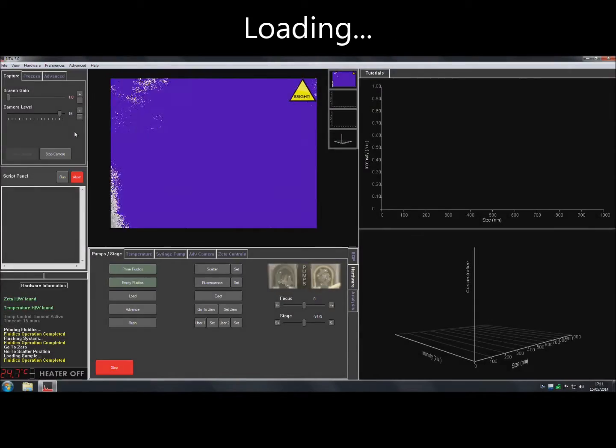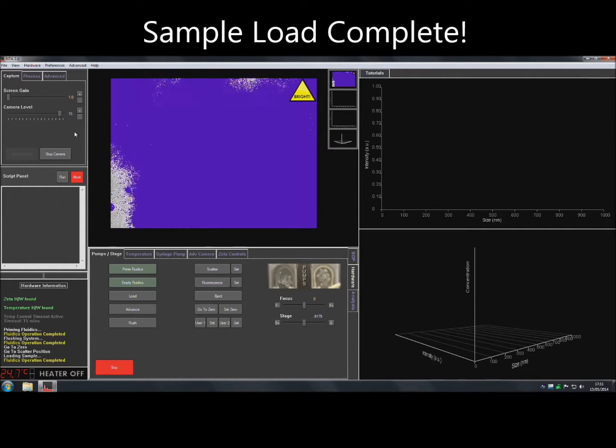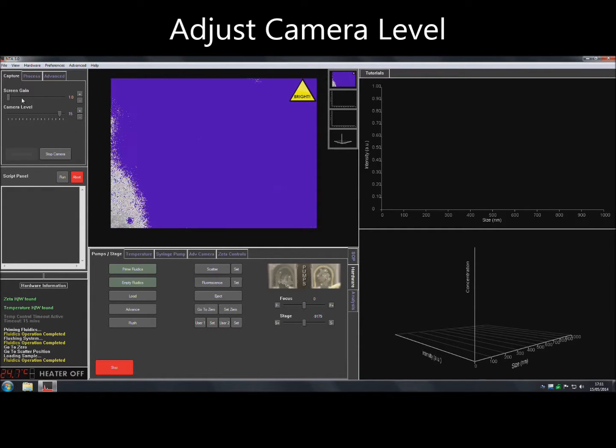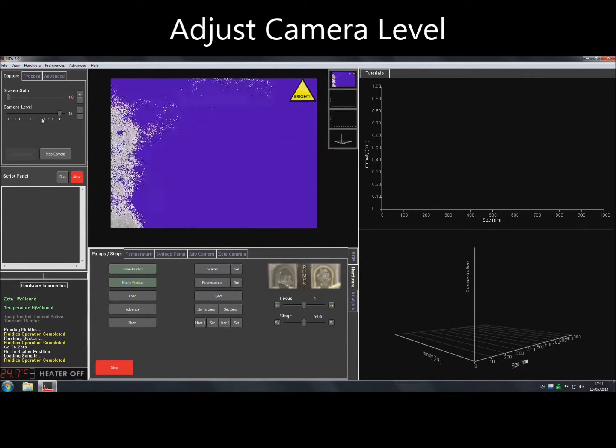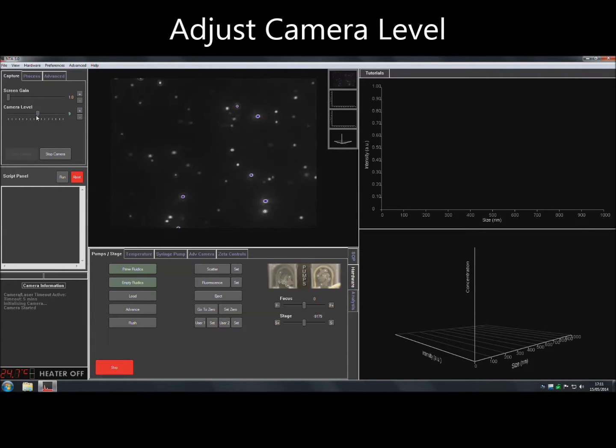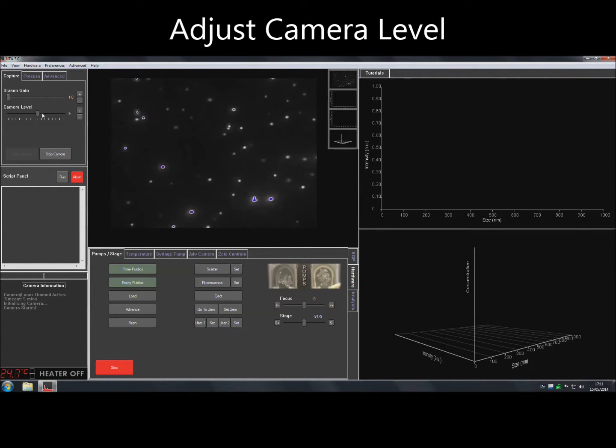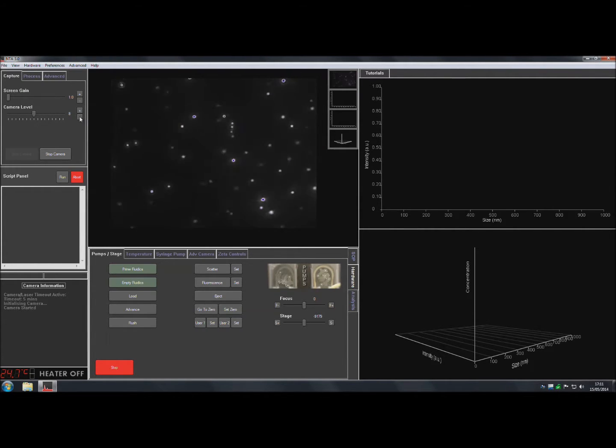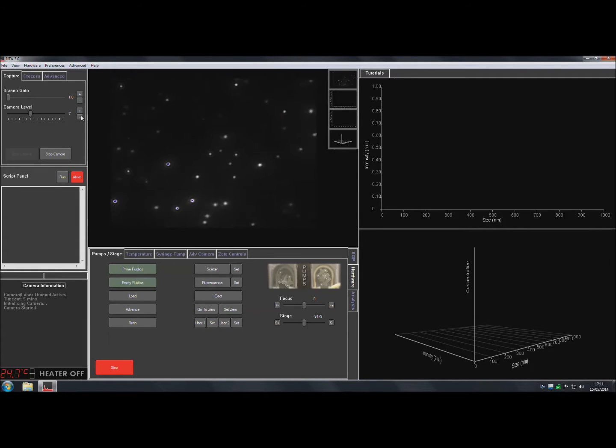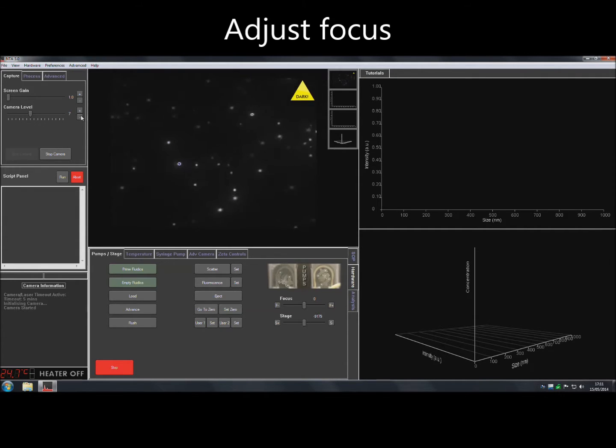Once the sample is loaded, the camera level should be adjusted until all particles present in the sample can be clearly seen but no more than 20% are saturated. The easiest way to select the right camera level is to turn the camera level up and then slowly turn it back down until the dimmest particles are lost. Then go back up one camera level to see all particles.